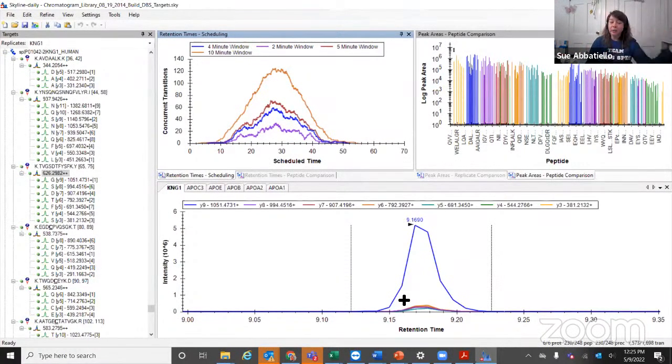Once you have a high number of peptides to target, like 100 or 1,000, that means your instrument's going to spend so much time in a given cycle on peptides that are not actively eluting, and you might only get a couple of points across your peak, because let's just say, for argument's sake, it takes 10 milliseconds for each of these transitions. The more you have, the more time it's going to spend in a given cycle. So what you do is you schedule your peptides.